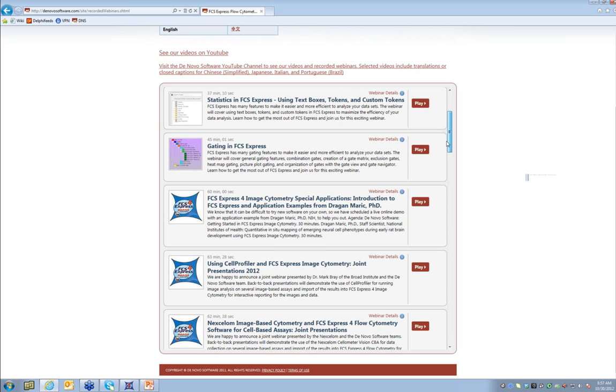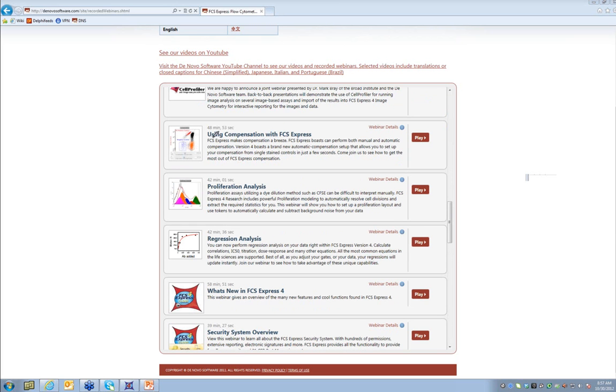For instance, here there are ones on compensation, ones on proliferation, what's new, our security system, and many, many different features in the software. So I encourage you to watch the webinars. They'll give you an overview of a lot of the different things that you can do in addition to what I showed today.